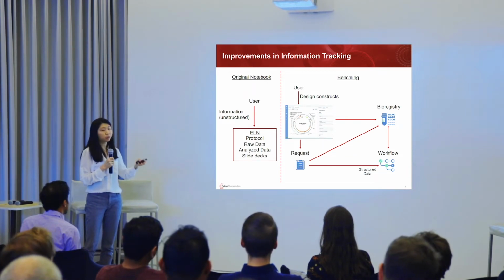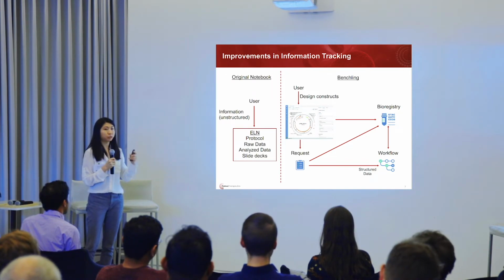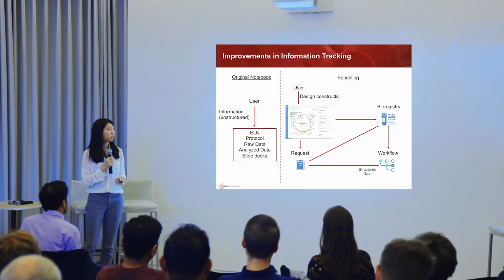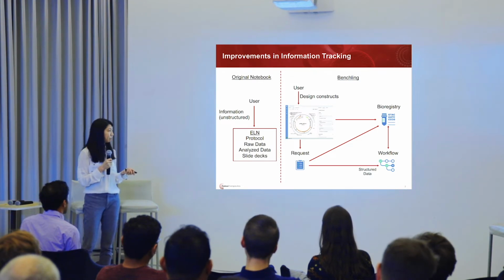The biology groups could go into the requesting structure, which would then query the bioregistry saying, I want that material in these cells, and then they can be executed along a workflow which pulls information from the bioregistry and also stores information into the bioregistry.